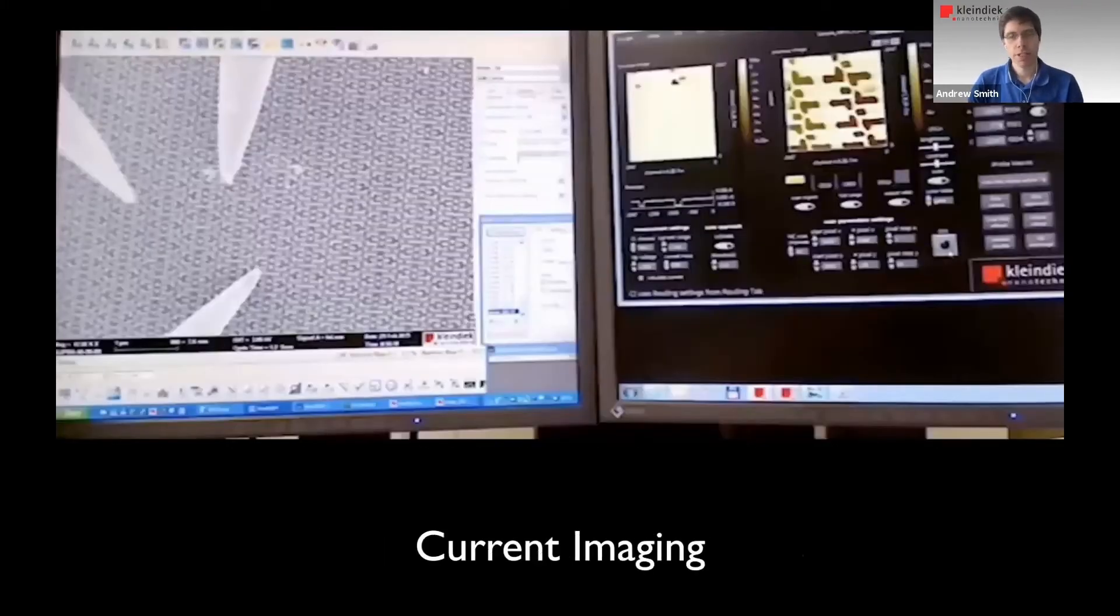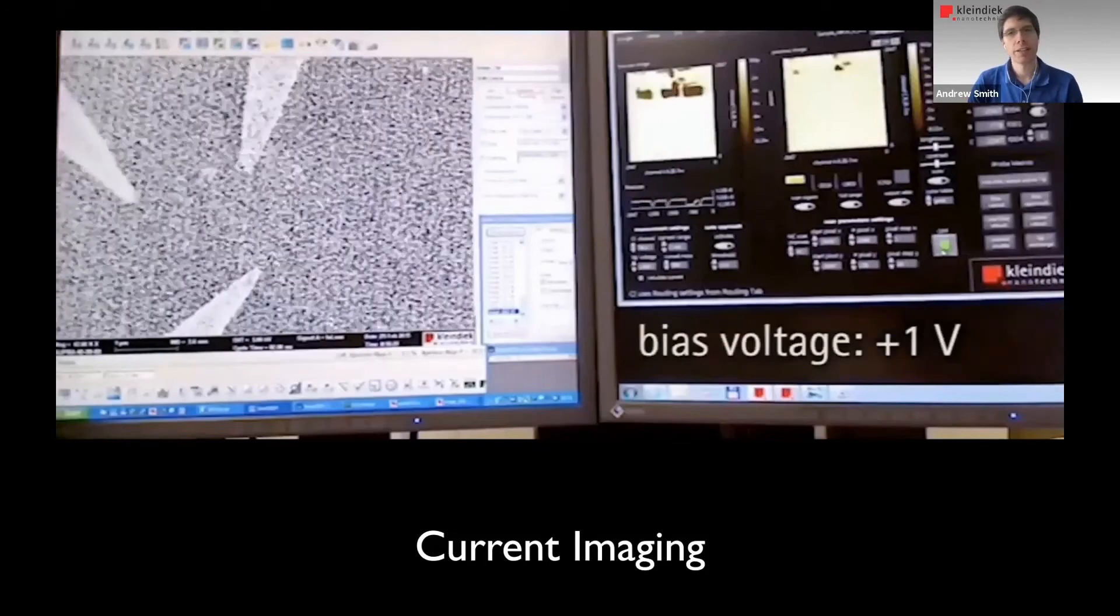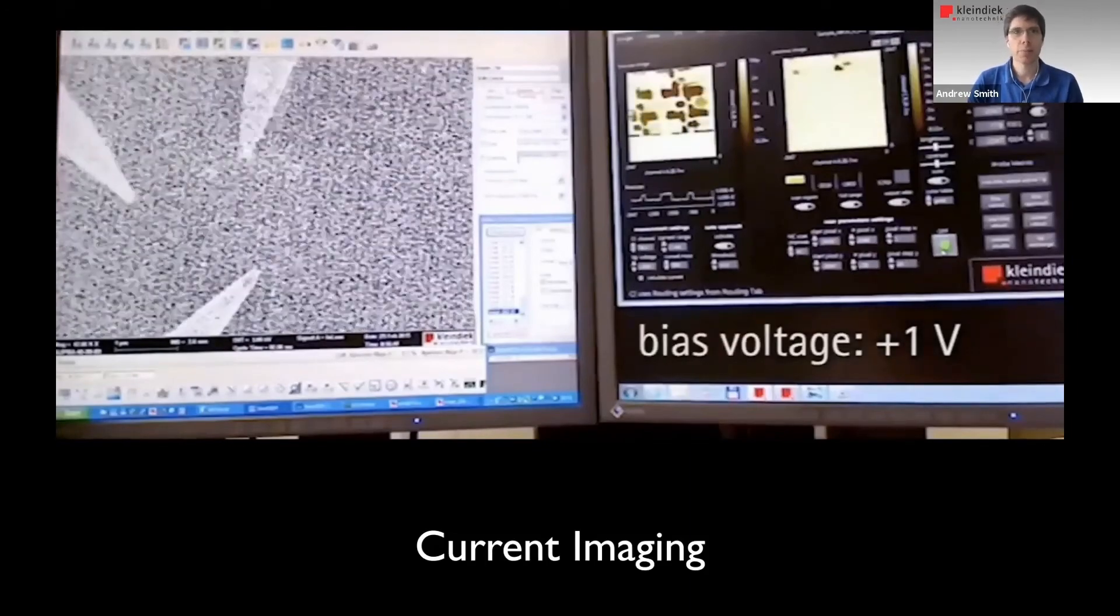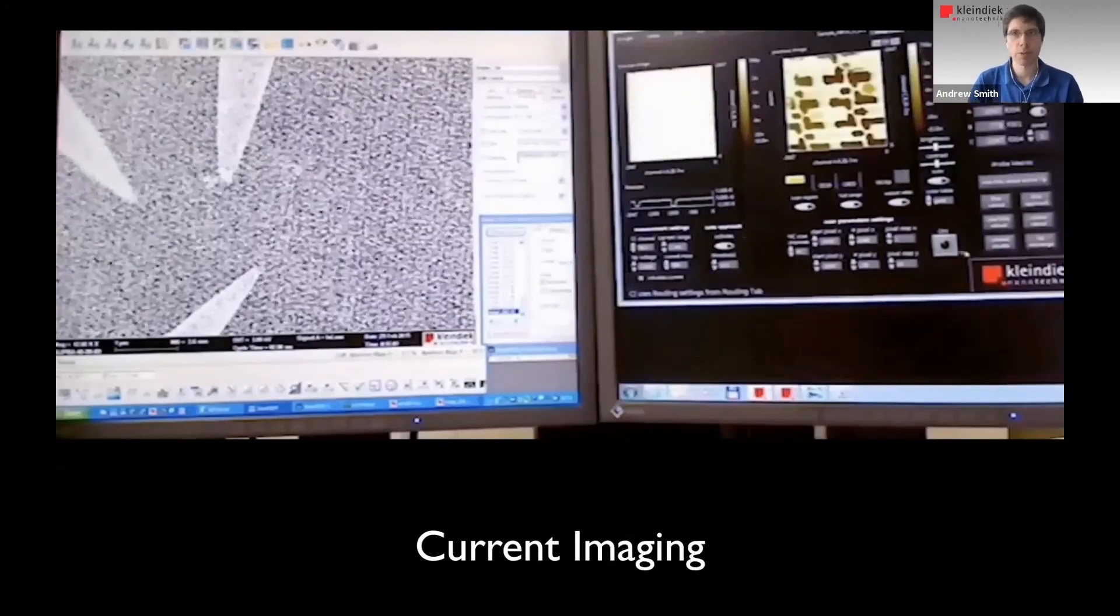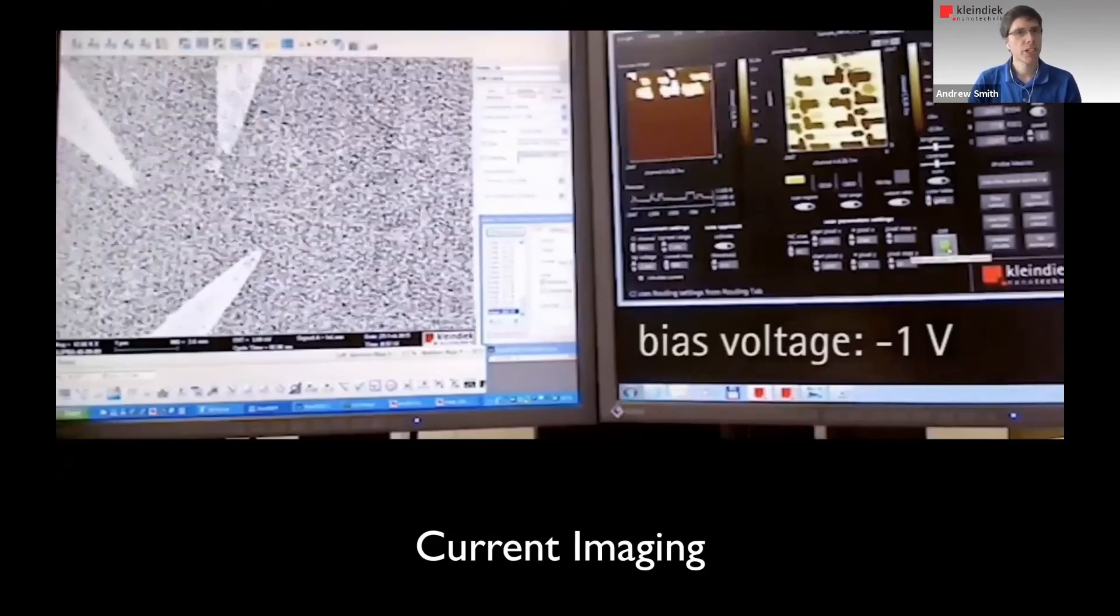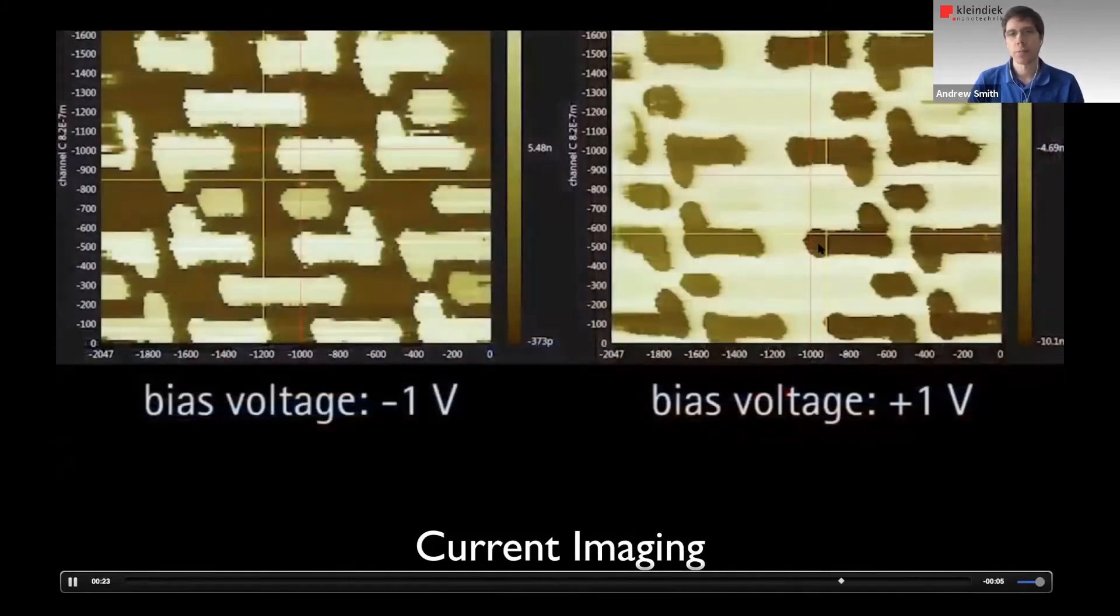Now, going into more detailed failure location methods, I do want to touch on current imaging. And this is not a conductive AFM, but it's kind of similar. What we do here is that we place a probe on a sample surface and just scan it over the surface. And there's no force feedback, and we can get away with this because our probes are so very stable and we know that the samples are very flat. This is a given in the type of samples we're looking at today. So we can just place a probe and then gently scrub the surface. And using different bias voltages, we can see here that we get different results. So we can use this to identify current flows where maybe they shouldn't be there or similar experiments.